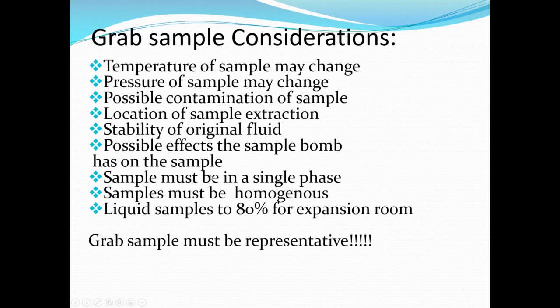Phase changes, we want to be, you know, again, aware of phase changes. It could condense between A and B. Samples must be homogeneous. Again, that just means well mixed. And when we take liquid samples, we only fill the sample bomb up to 80% to allow for expansion.